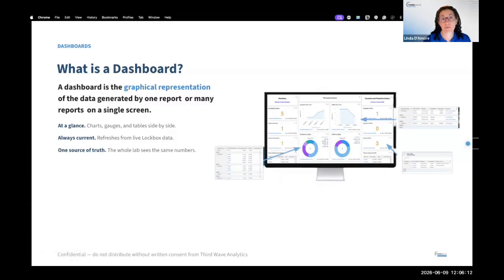So sometimes what you need for taking a decision is not just one report, you need multiple reports. What happens with the dashboard is that it gives you the ability to show different reports in the same place. That will allow you to take a decision based not just on a sample, but on a particular account or a particular procedure or process that happens in your organization. It is one way of seeing one big picture while you can also go into small details.